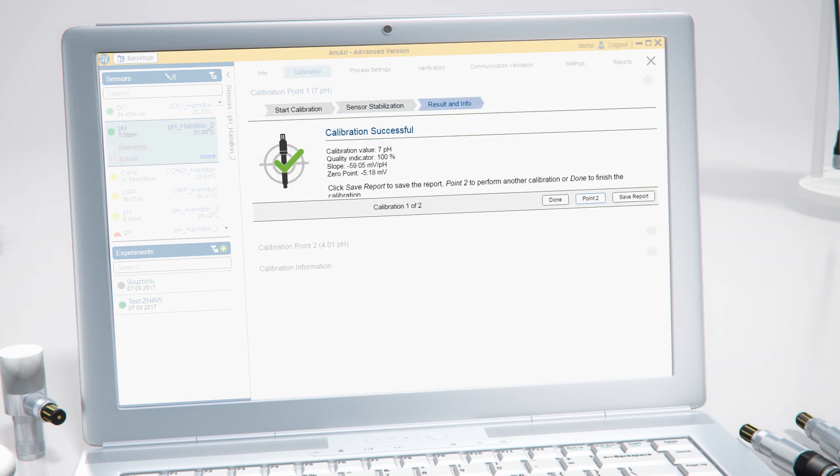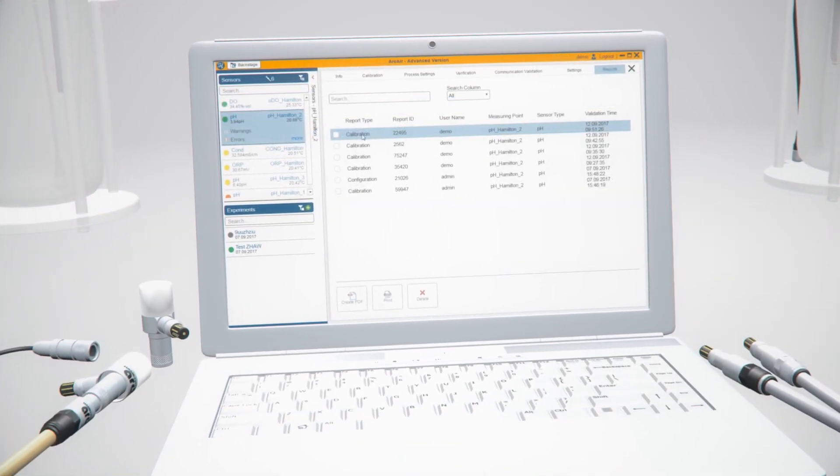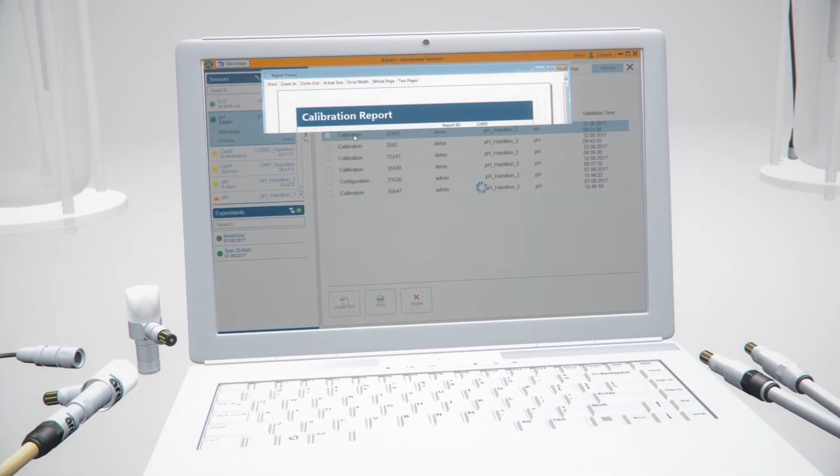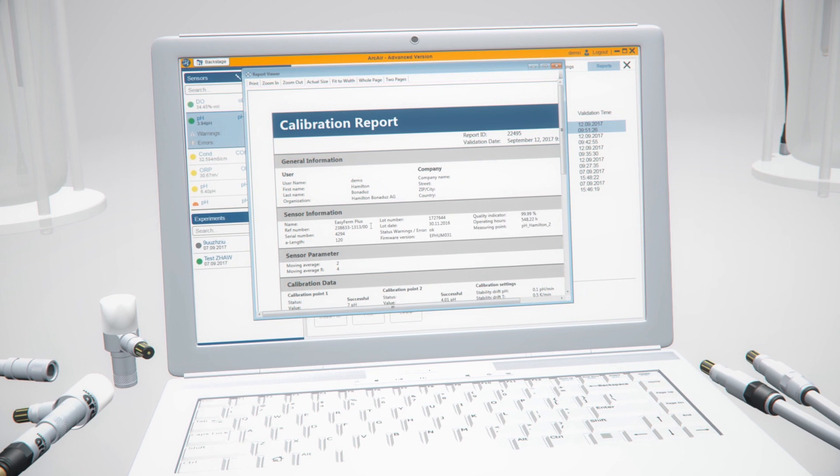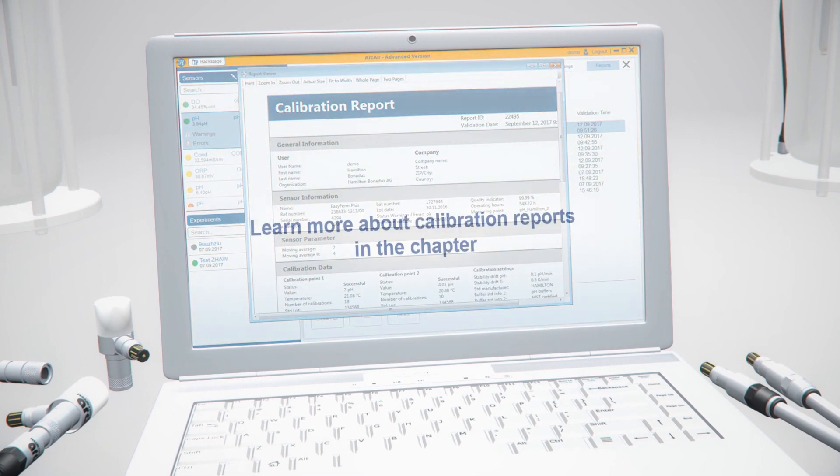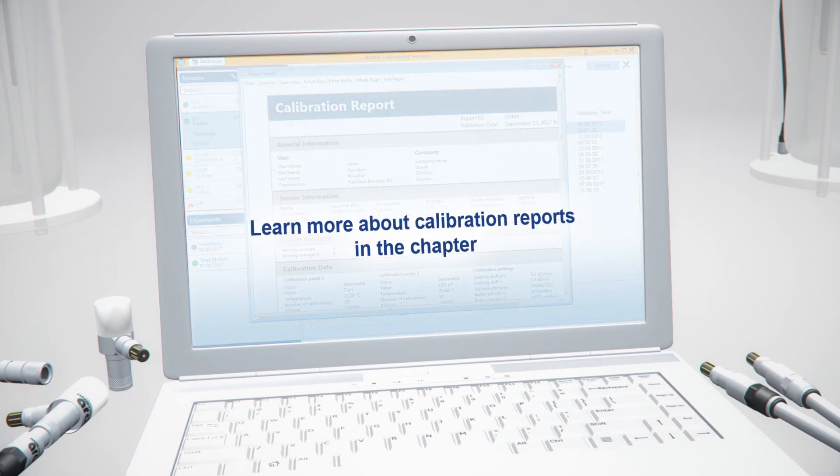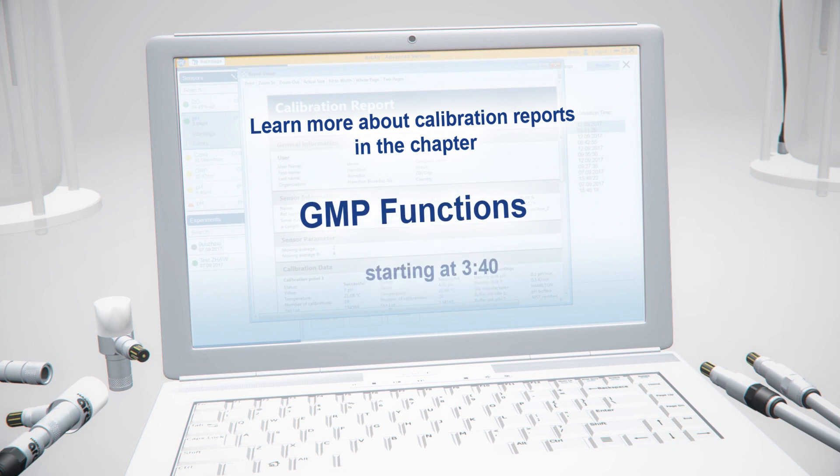In this example, we have shown the calibration of a pH sensor. Follow the same wizard steps when calibrating other sensor parameters. If you would like to learn more about calibration reports, please go to the chapter GMP functionalities.